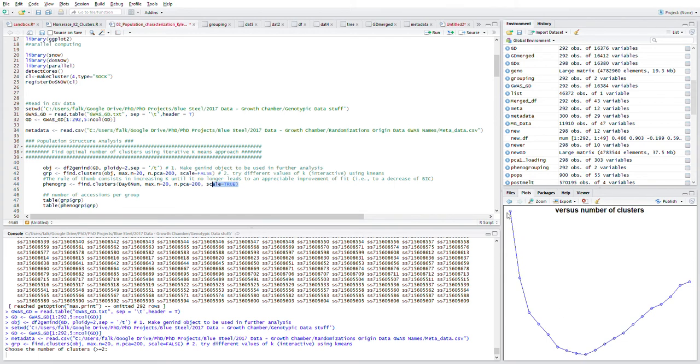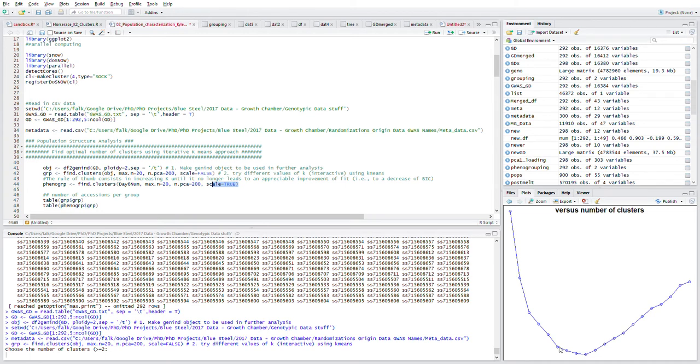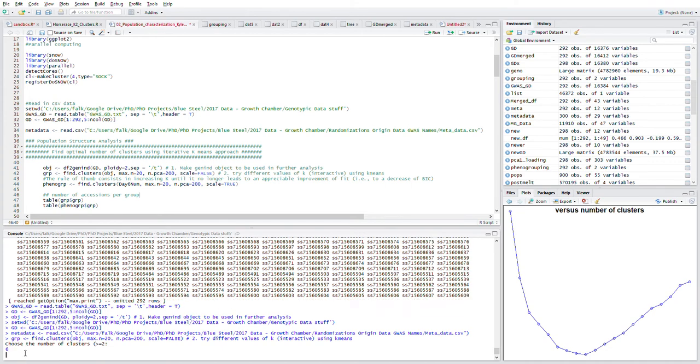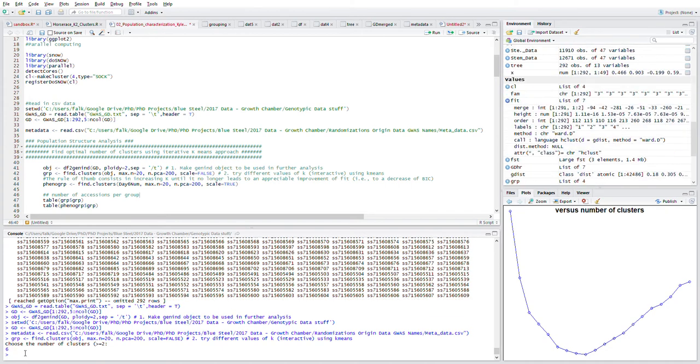Nine would be ideal, but it even starts to plateau at 6, so I'm going to take 6 as my approach. It's asking me down here to choose the number of clusters, so you have to wait until this completes. I'm going to enter 6 and enter, and away we go.